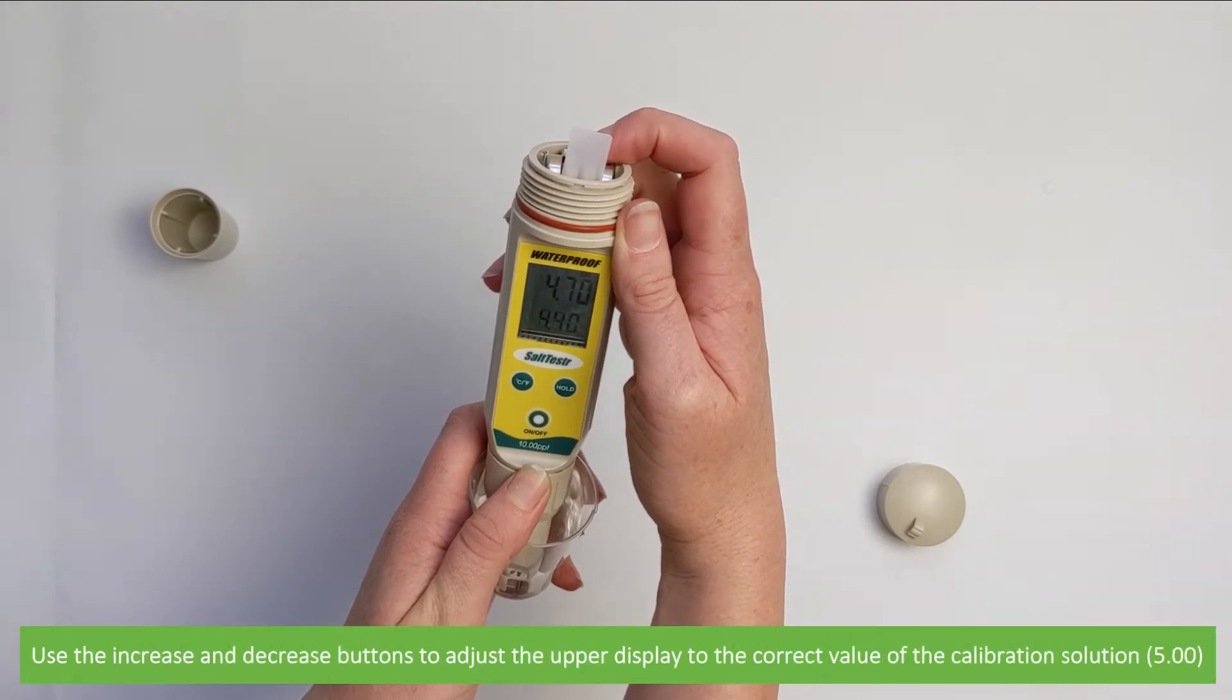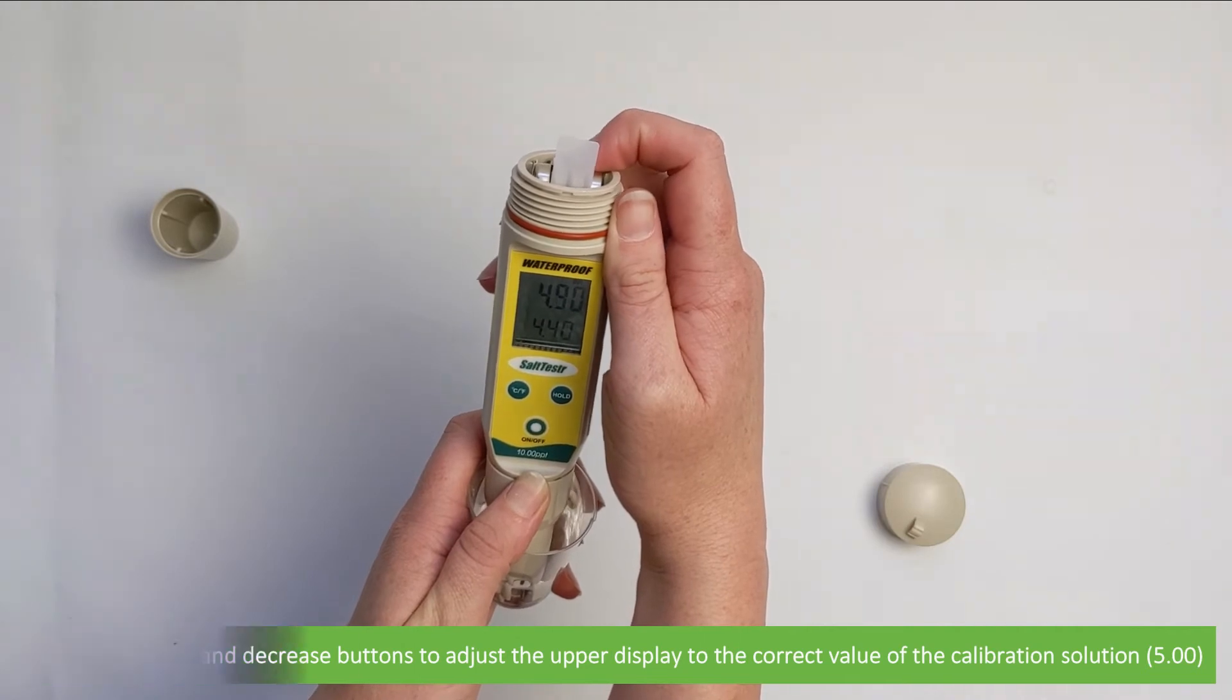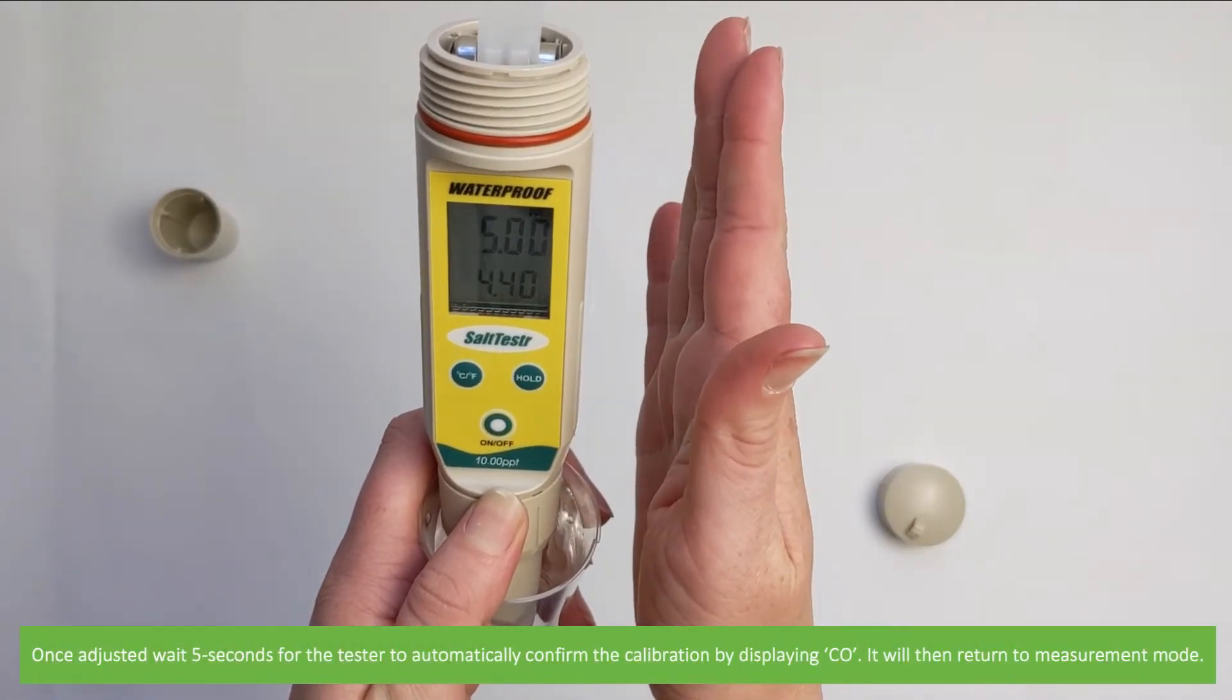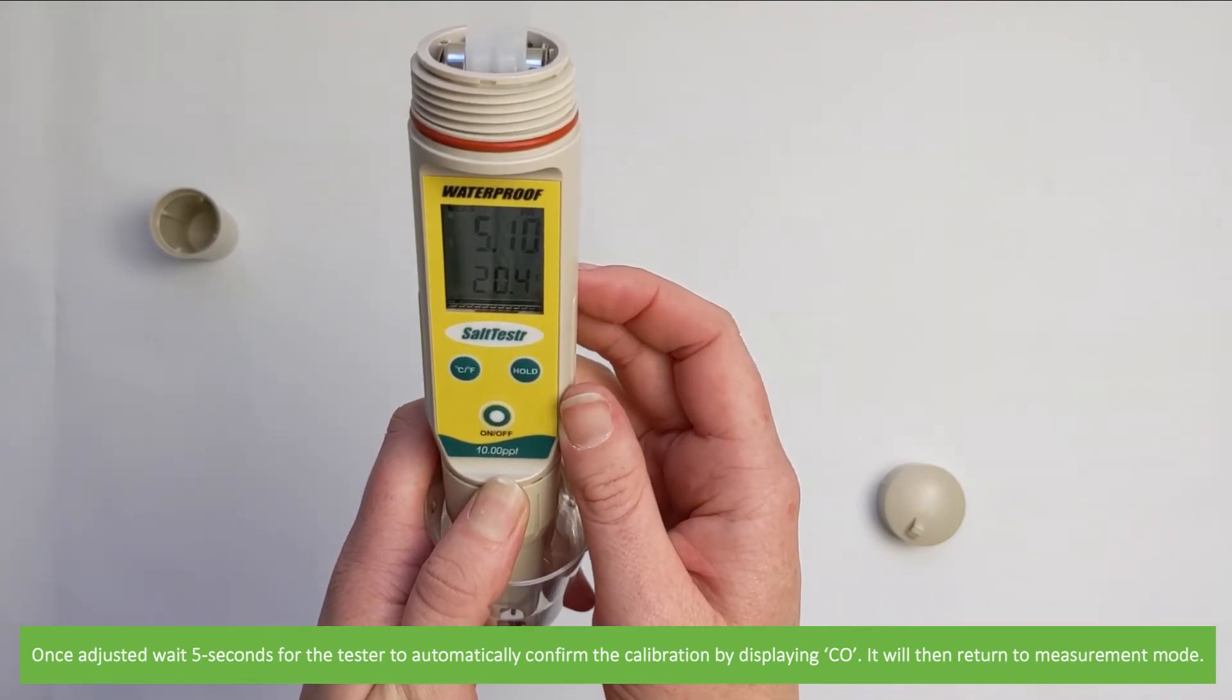Use the increase and decrease buttons to adjust the upper display to the correct value of the calibration solution. Once adjusted, wait five seconds for the tester to automatically confirm the calibration by displaying CO. It will then automatically return to measurement mode.